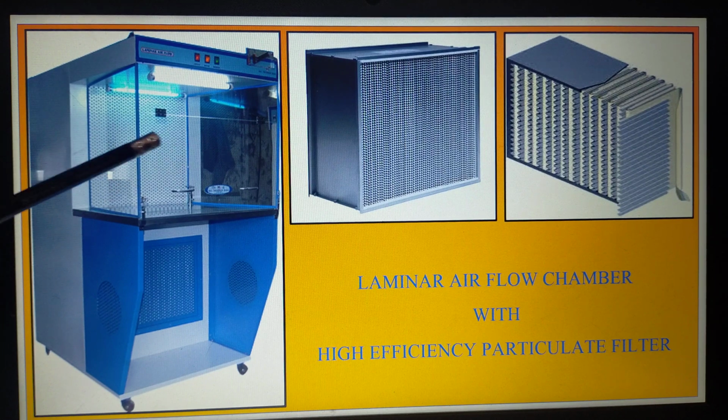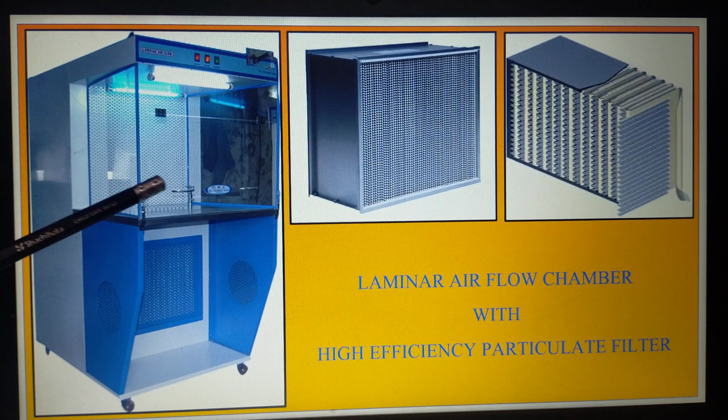This is a glass door, right? All three sides are closed by glass walls, and you can see a filter inside the laminar chamber. That is what we call the HEPA filter, high efficiency particulate air filter. This filter is very important because it filters the fine dust particles present in the air, and the air which blows out is devoid of any sort of dust materials. That is why we are using this HEPA filter.